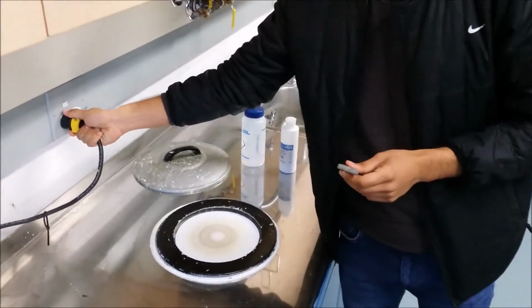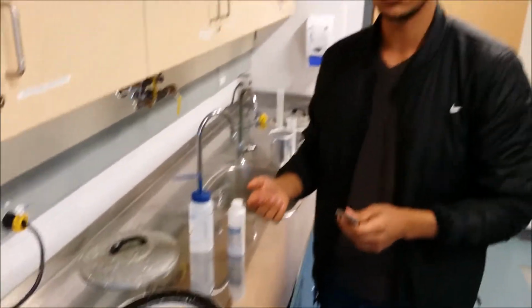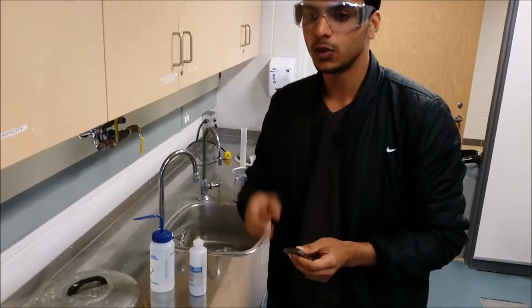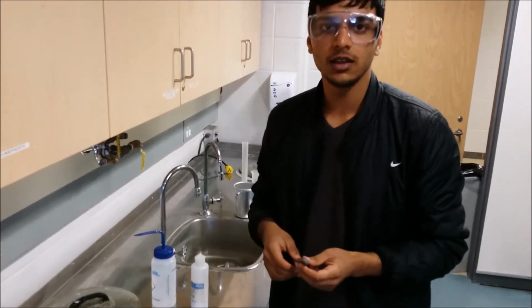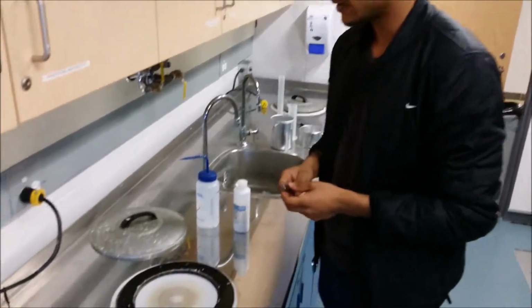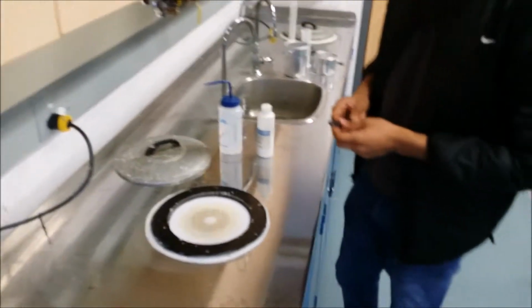An important thing while using this is not to wear too long sleeves or baggy clothes, so they don't get entrapped in the wheel. Don't wear any jewelry, necklaces, watches or wristbands. So I'm switching it on. Now it's moving.